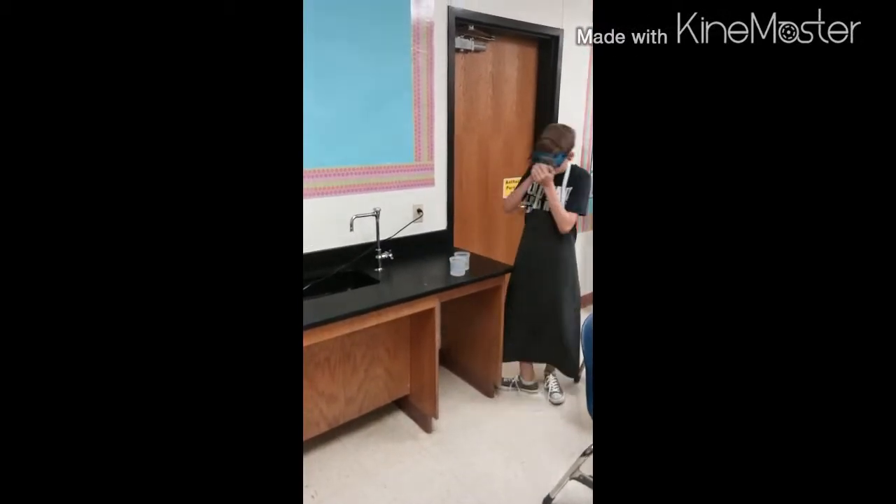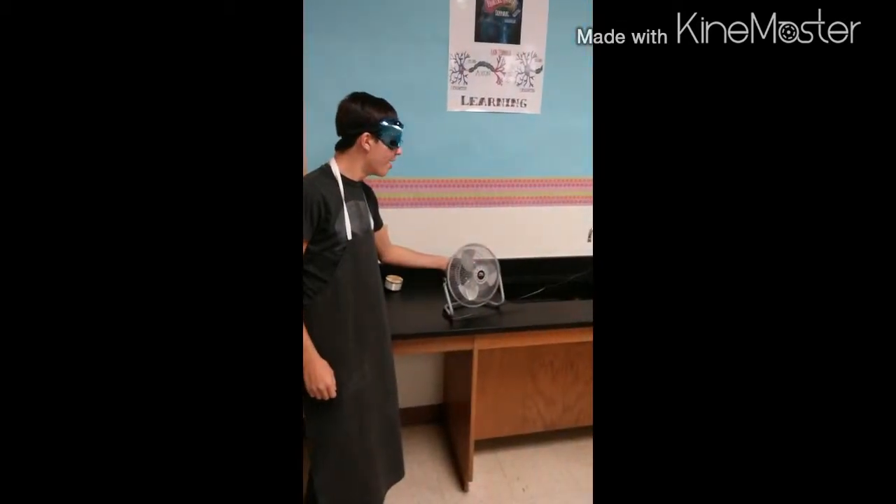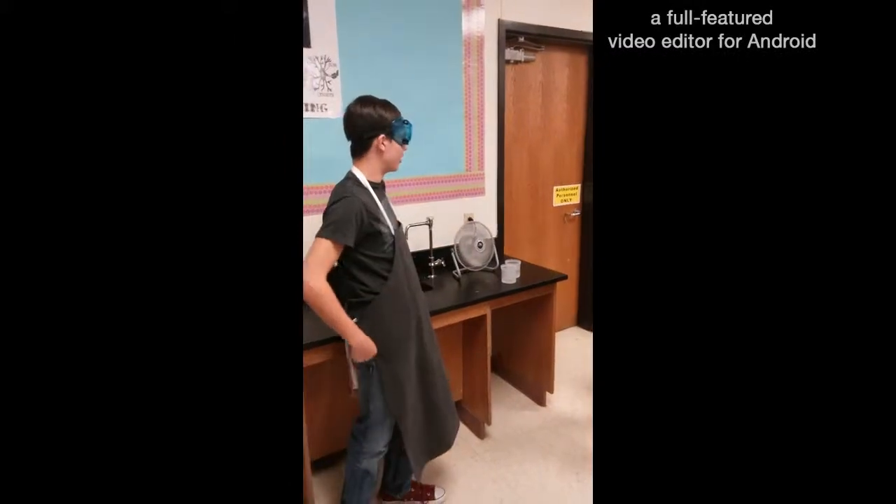Oh, that smells so bad. I wish it was a well-ventilated area. Did someone say well-ventilated area? Because I've got a fan. Perfect for well-ventilated areas. Whoa!